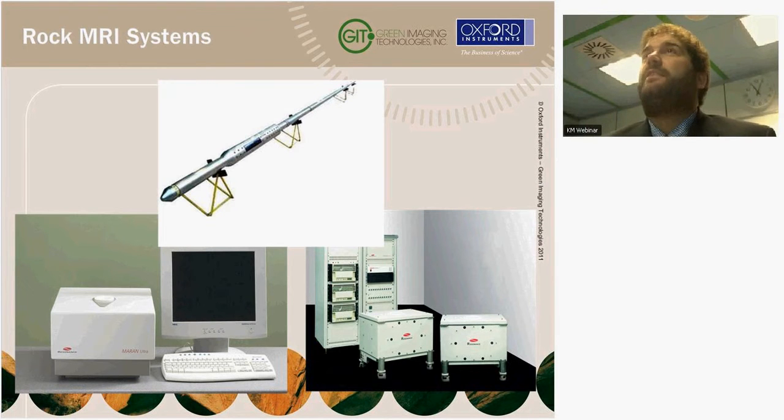The equipment is quite different for logging. The diagram is a logging tool. It's probably quite an old logging tool at this point. It's an NMR logging tool in which you drop it down the hole and do a wireline log. These NMR measurements I'll describe in a few minutes. The lab equipment is quite different. It's desktop based. These are some of the older models, but it's smaller and measures 1.5-inch core plugs. You can have larger equipment to do whole core as well.